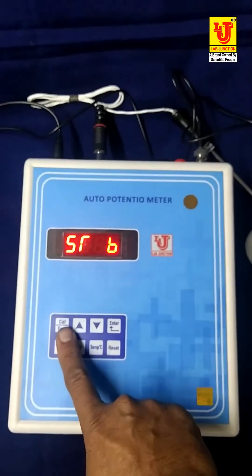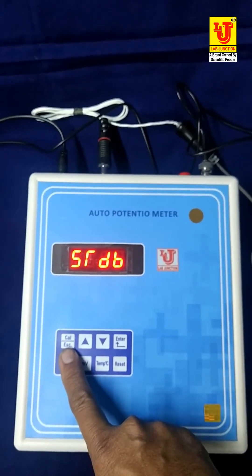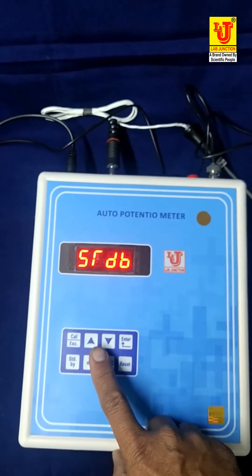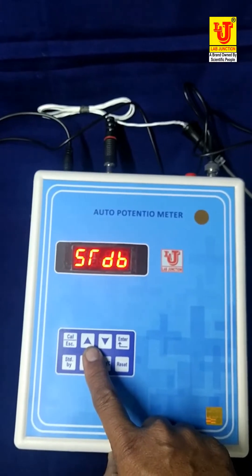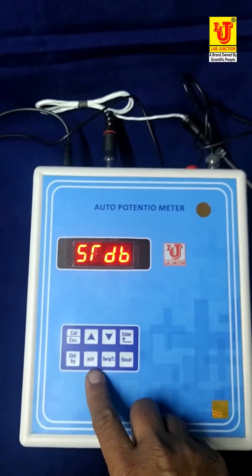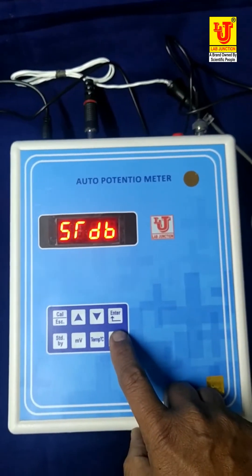This is the Cal key — Cal/Escape key. Cal is for calibration. Escape is to go one step back, like on a PC or laptop. This is the up key, this is the down key, this is enter, and this is the standby key. Now this is on standby. And this is the reset key. At the start, you have to reset like this — press and long press.